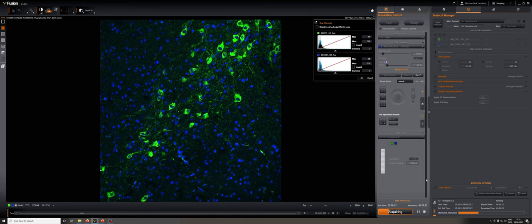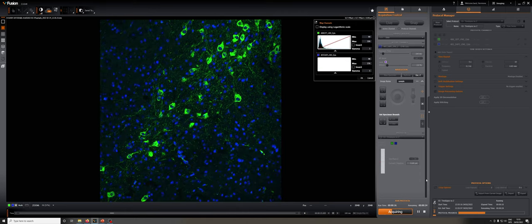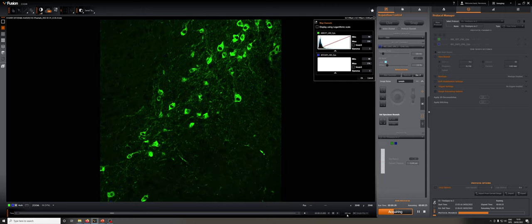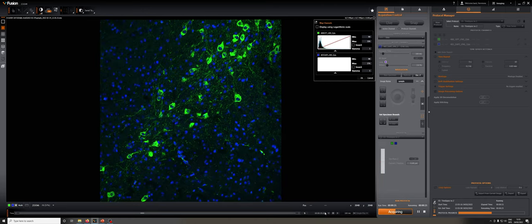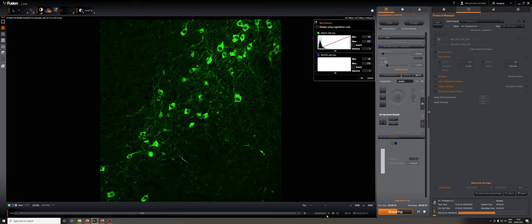So it's waiting five seconds between the start of each imaging session, and here if we scroll through this we can see the exact time at which each of these frames was acquired.